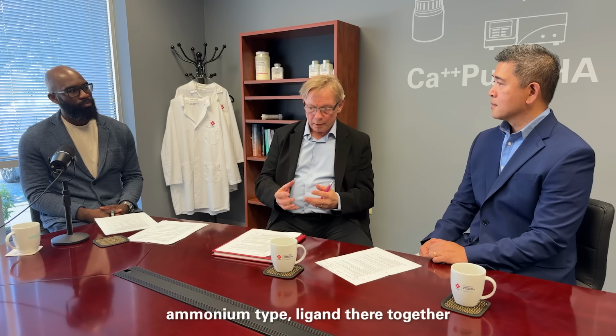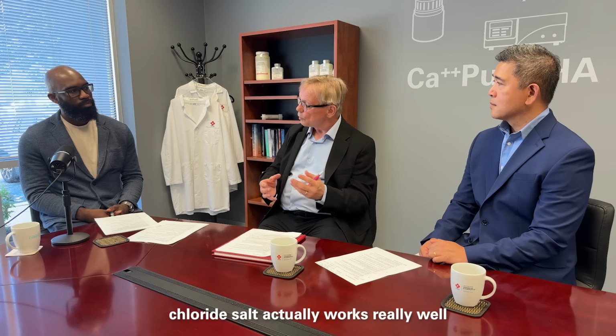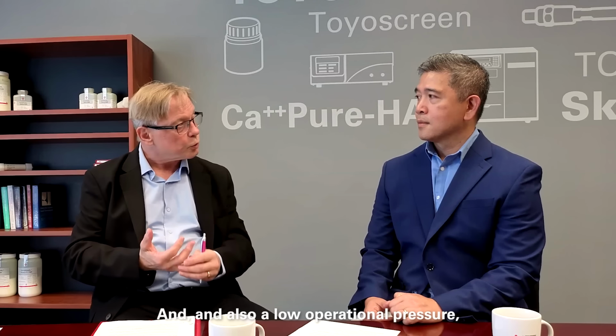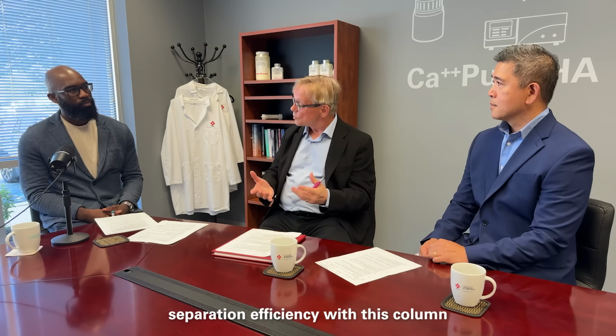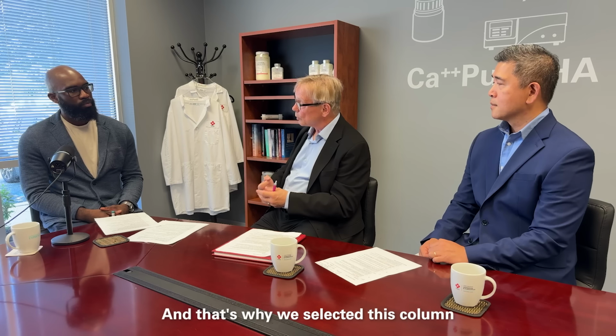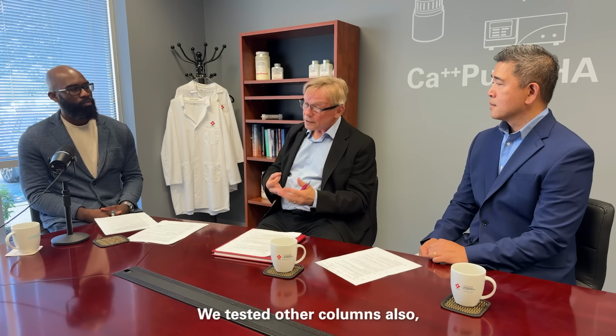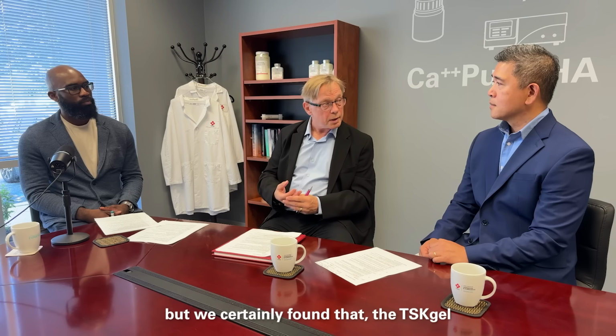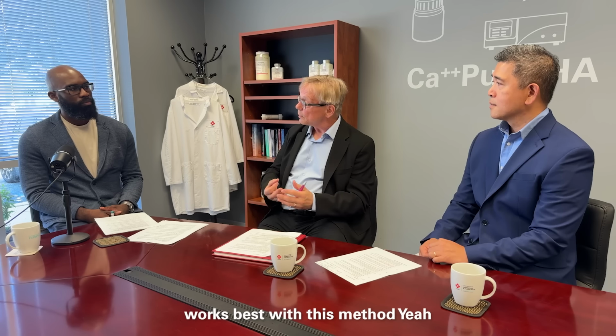Together with the choline chloride salt, this column works really well. It has good bonding chemistry and low operational pressure, and the separation efficiency with this column is very good, and that's why we selected it. We tested other columns also, but we found that the TSKgel Q-STAT column works best with this method.